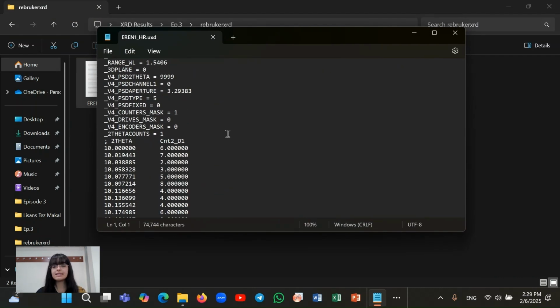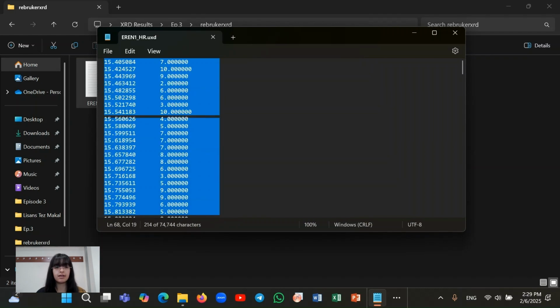My PC's setup language is English, but if you use a different language like Turkish and you want to draw this diagram in the Turkish language setup, you need to change the dots to commas or the commas to dots. So it's really easier to use the Excel program. You need to copy and paste your data to Excel.